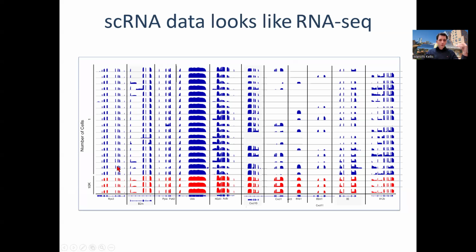And then this is now looking at multiple genes on the x-axis. So here you can see the actual exon intron structure. As you all know, there's the original genome here, and then every tick mark is a protein coding exon. And then these exons get spliced as they get transcribed. There's co-transcriptional splicing and a maturation of the mRNA that then gets exported, fully spliced, to the cytoplasm where translation begins. So when you now sequence those RNA reads, you will see that they fall on top of the protein coding exons. That's because in these experiments, we're looking at cytoplasmic RNA, okay?